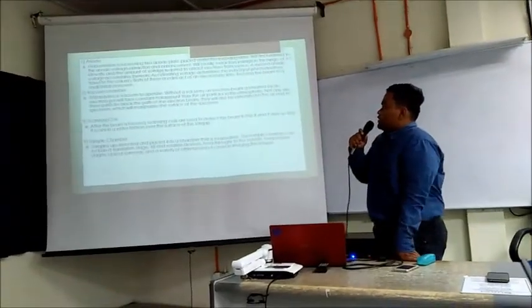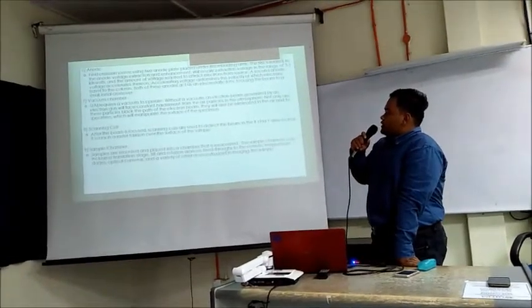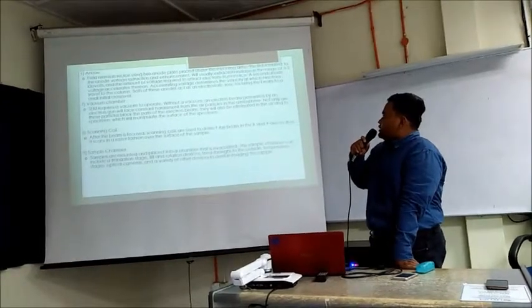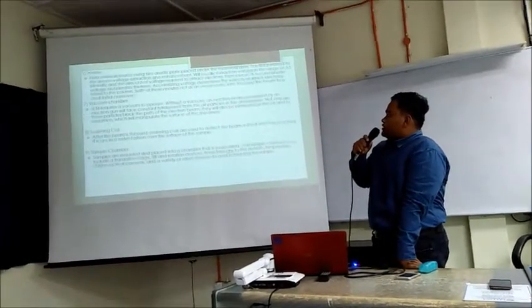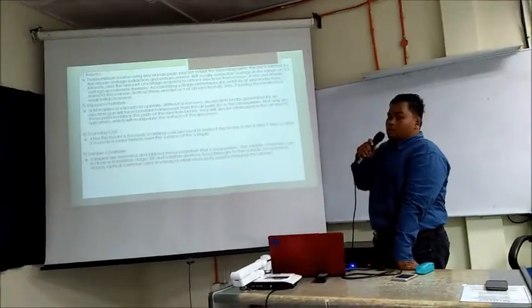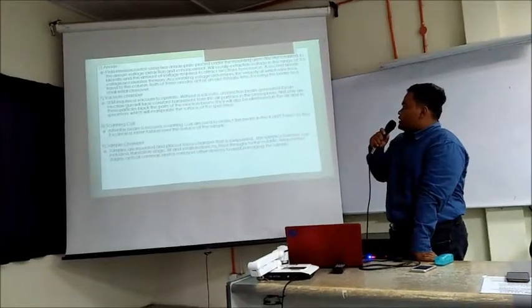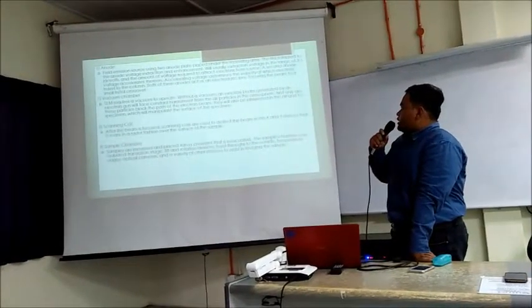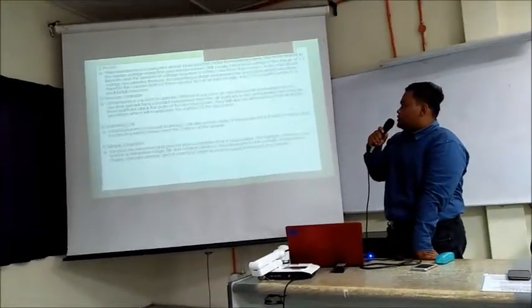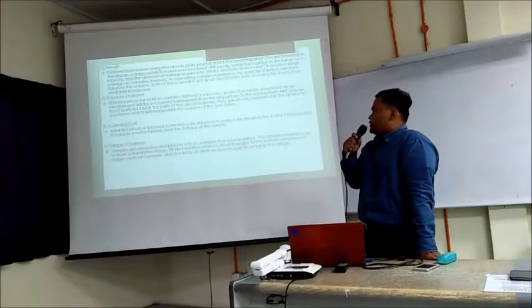Okay, next, vacuum chamber. SEM requires a vacuum to operate. Without a vacuum, an electron beam generated by an electron gun will face constant harassment from the air particles in the atmosphere. Not only do the particles block the path of the electron beam, they will also be ejected in the air and onto the specimen, which will manipulate the surface of the specimen.